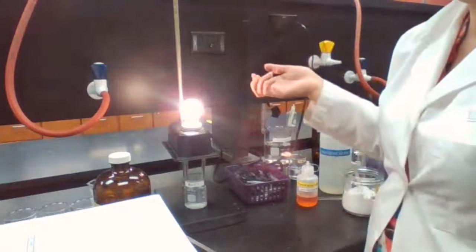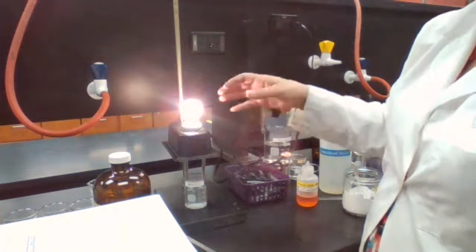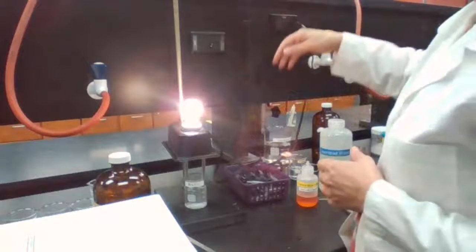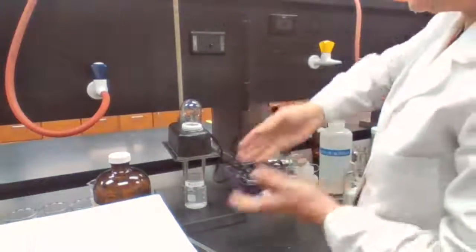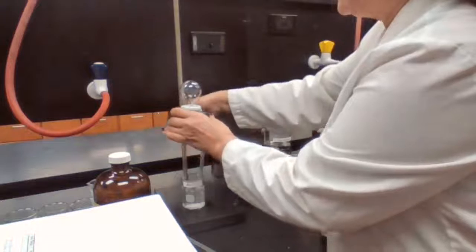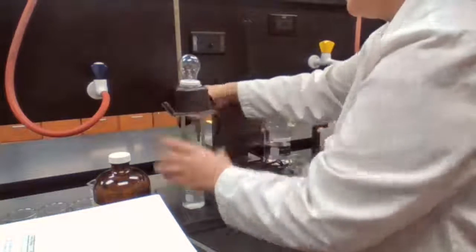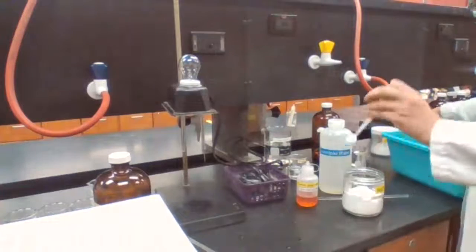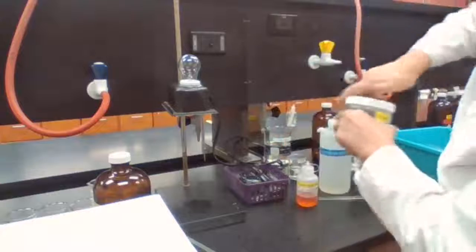That means this is an ionic compound that is completely soluble in water. So it generates lots of ions that transfer the electrons, conduct electricity, and we get to see that. Okay, light. So a strong electrolyte for sodium chloride solution. Solid sodium chloride is non-electrolyte.